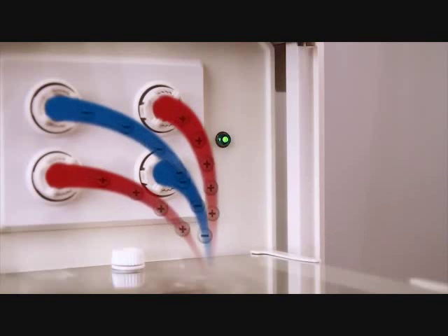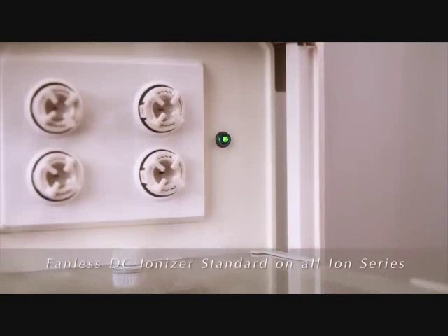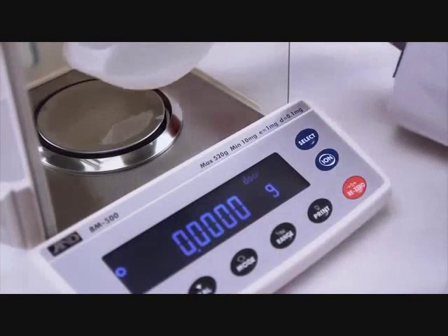Because static can seriously compromise precision weighing, A&D decided that the fanless DC ionizer is the best technique to eliminate this problem. To use, just press the ION button and briefly hold the sample in front of the ionizer in the neutralizing chamber to eliminate static.